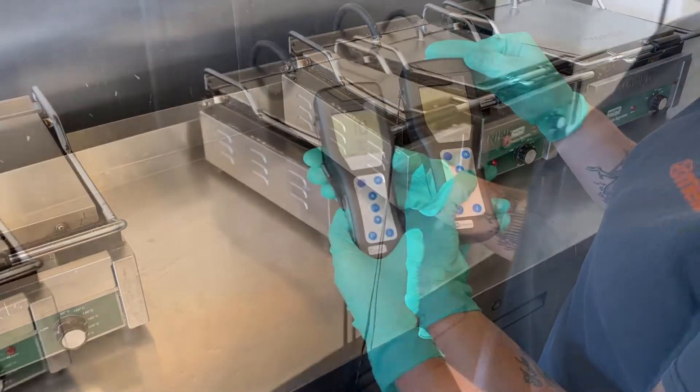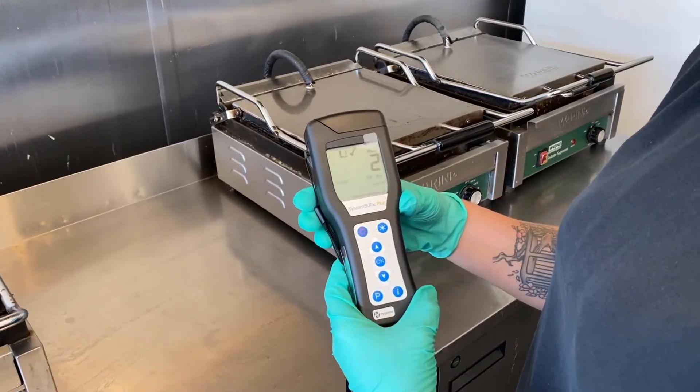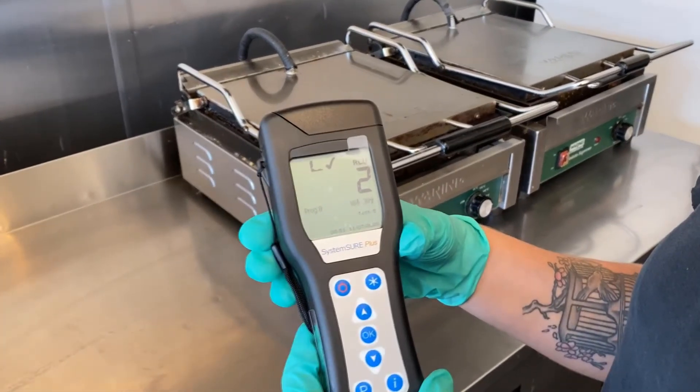What will the result tell us? Wow, what a remarkable difference — from 840 RLUs down to just two with Bacoban. Get in touch now and experience this test for yourself.